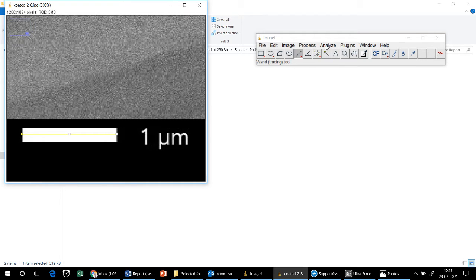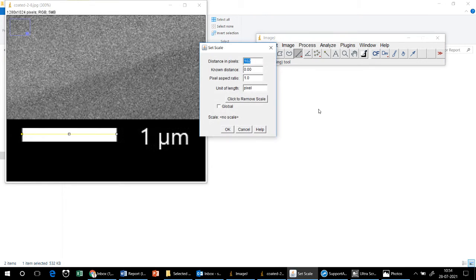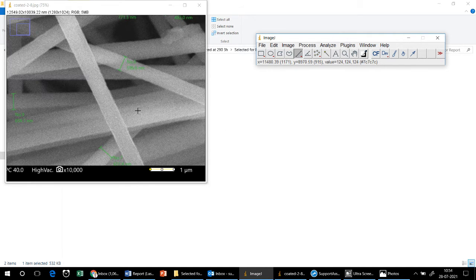Now go to Analyze > Set Scale. Here you can see the known distance. Since this total distance is 1 micron, which equals 1000 nanometers, and I want the fiber diameters in the nanometer range, I will put the value as 1000 and set the unit of length to nanometers. Click OK.